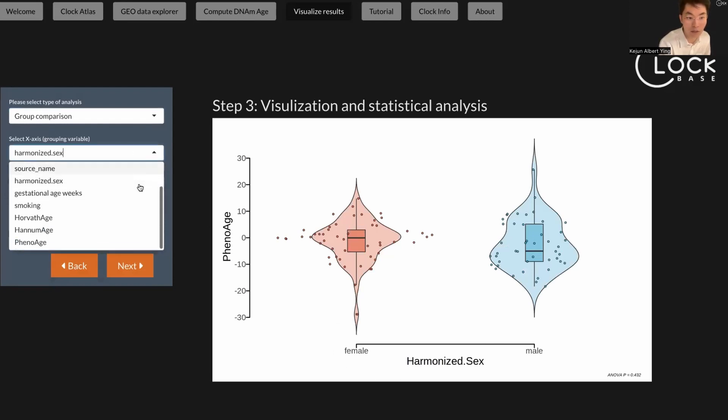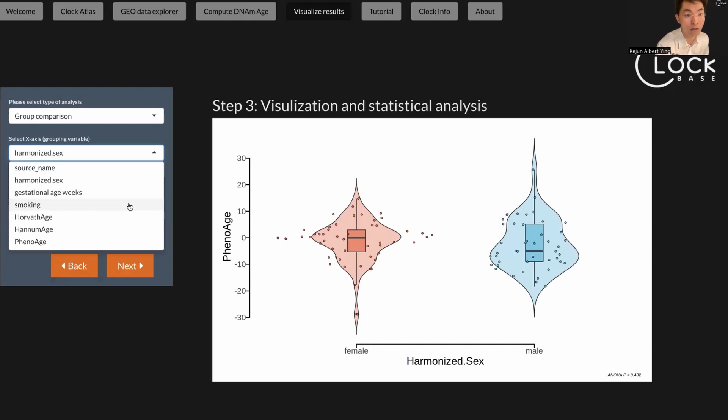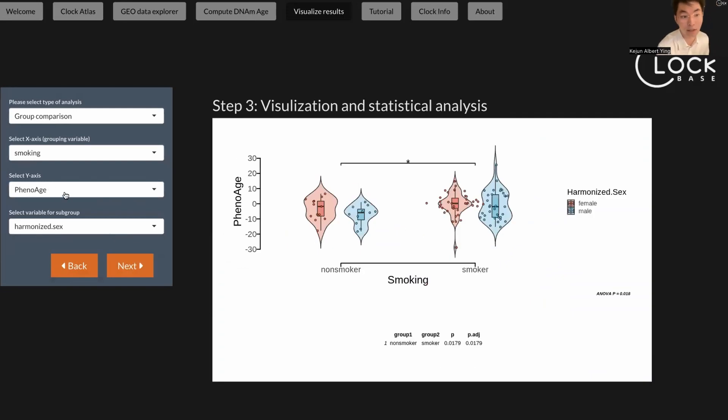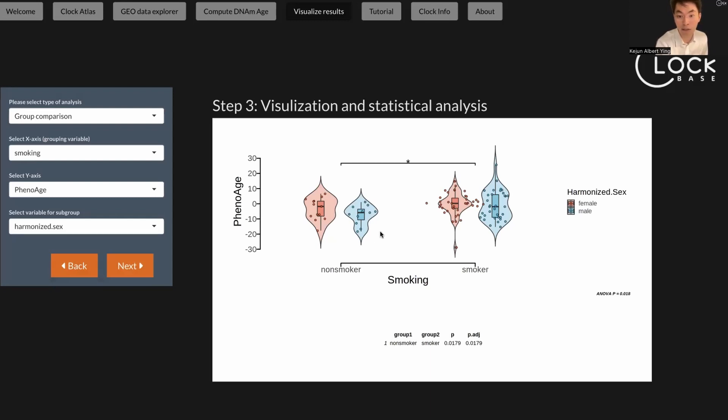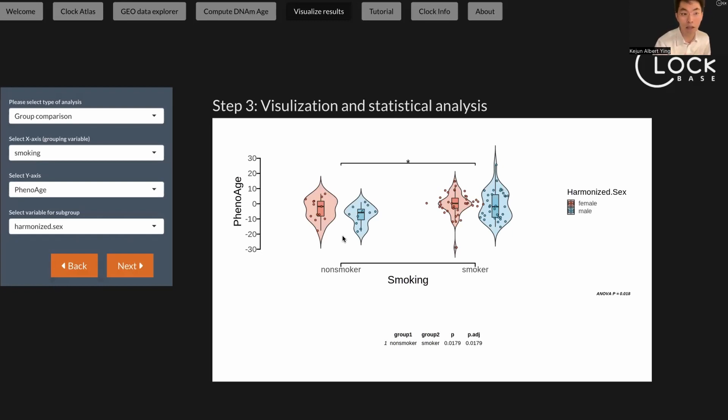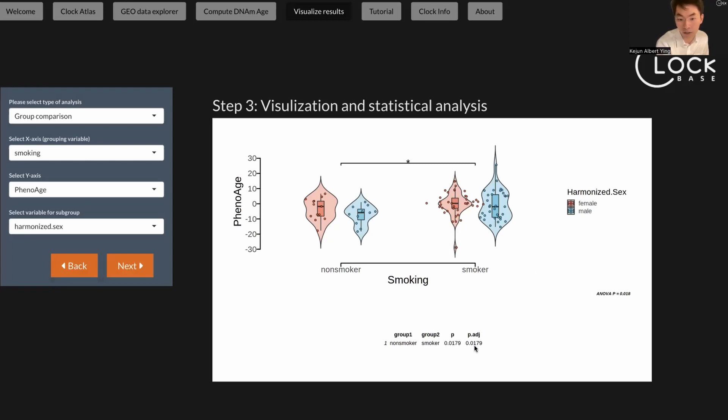You can actually choose here, for example, what's important in this experiment, in this dataset, is the smoking condition. So here, let's change the x-axis to the smoking condition, and the y-axis is the PhenoAge. Here you can actually see the violin plot showing that the smoker, or the placenta from the smoker, actually have a significantly higher PhenoAge compared to a non-smoker. It means that smoking may accelerate the biological age of the placenta in this dataset. Here you have a t-test and you have a p-value here.